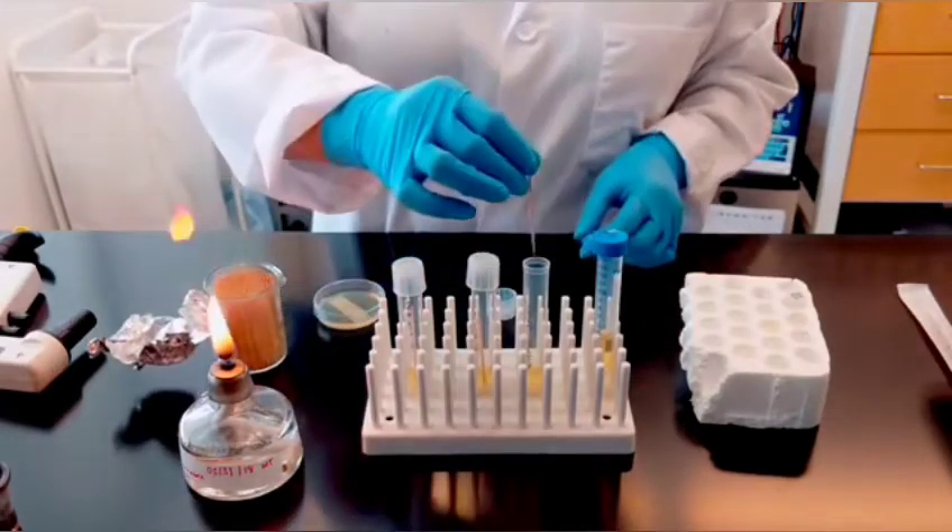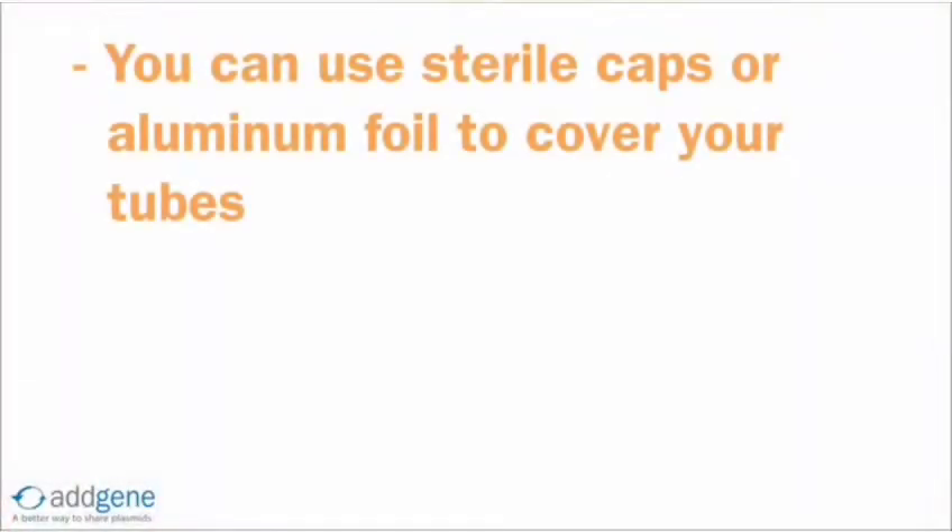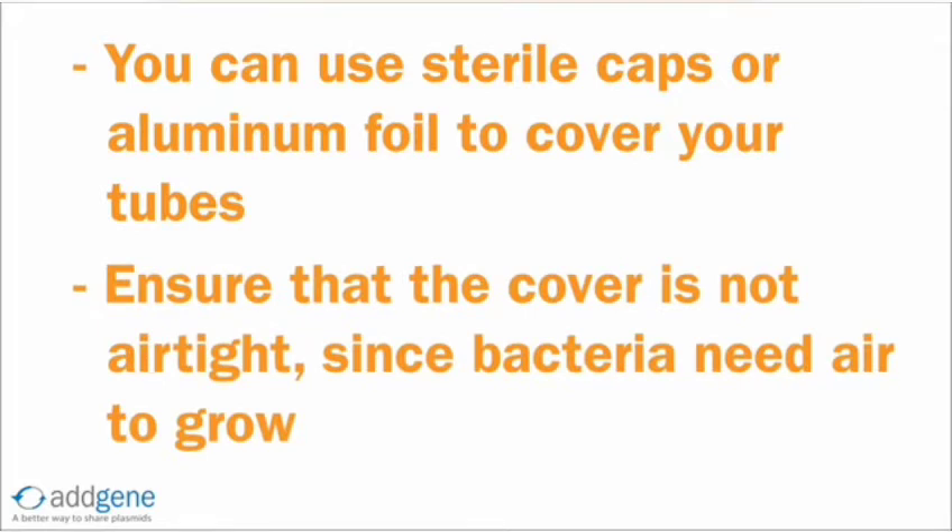For the negative control tube, simply drop in a sterile toothpick. If your tubes do not have sterile caps, you can loosely cover the tubes with aluminum foil. Just make sure you do not use a cap that is airtight — bacteria need oxygen to grow, so using a loose-fitting cap ensures proper bacterial growth.